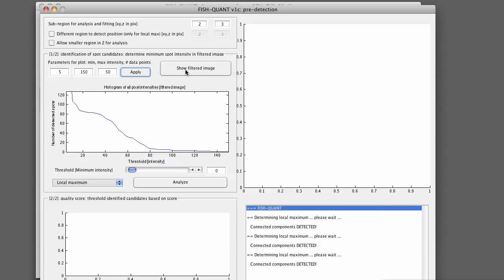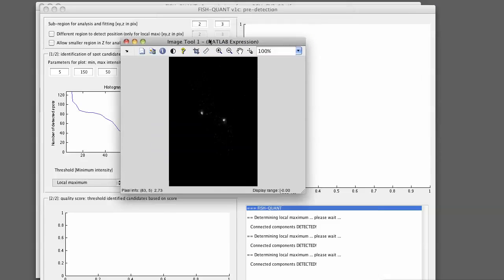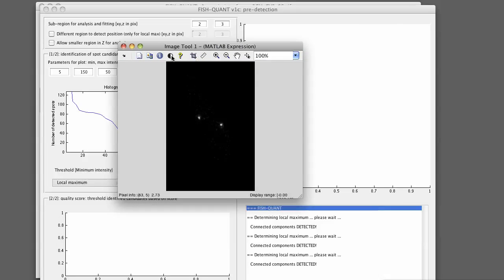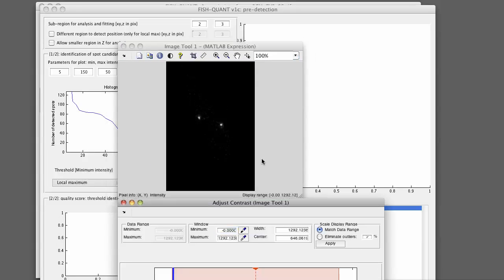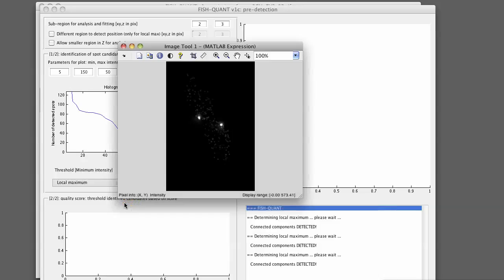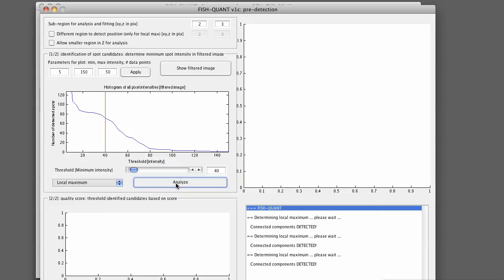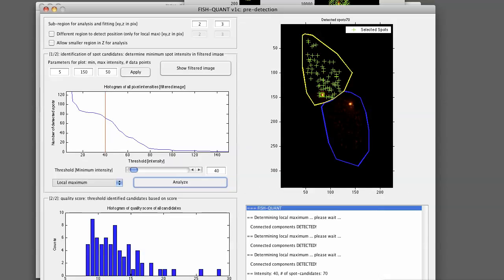You can then also show again the filtered image from within here to get an idea how bright your spots are. We already did that before. You know, for us, it's around 50 for the lowest. So we can set it to 40 and analyze.